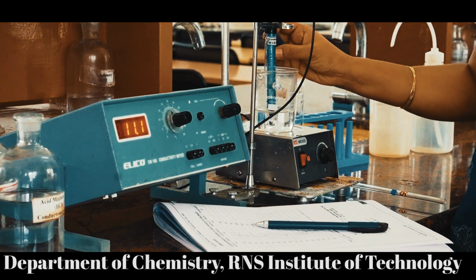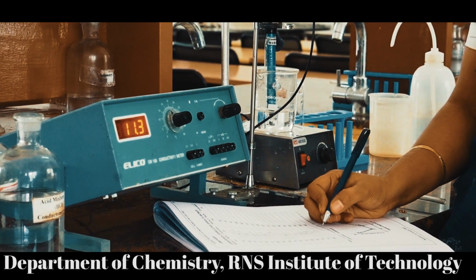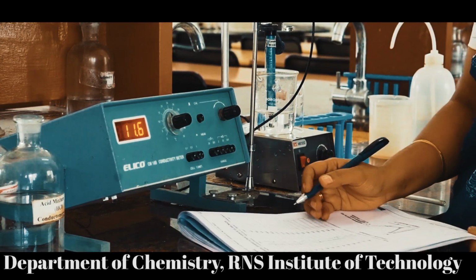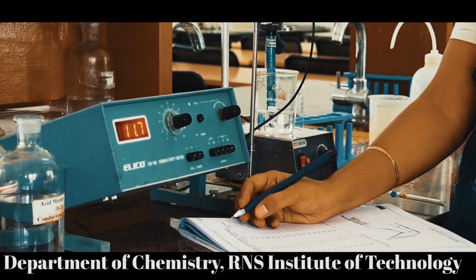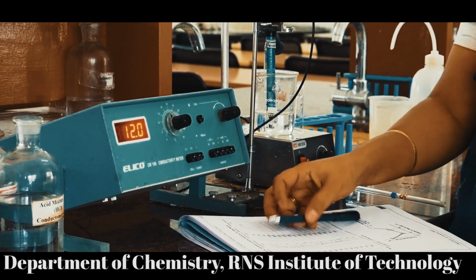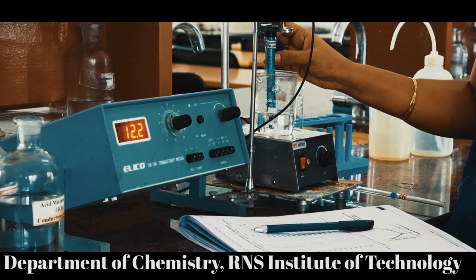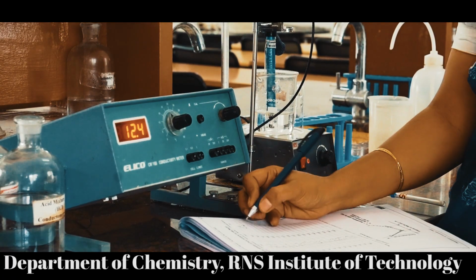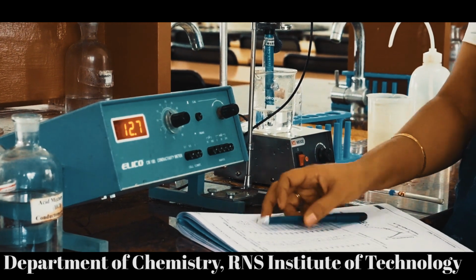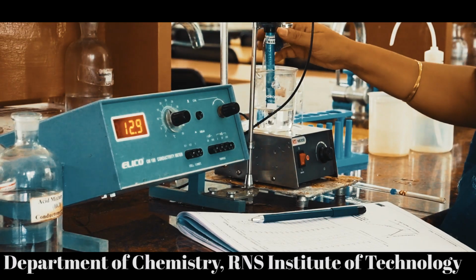Again add 0.5 ml, wait for 2 seconds. Again add 0.5 ml of the NaOH.